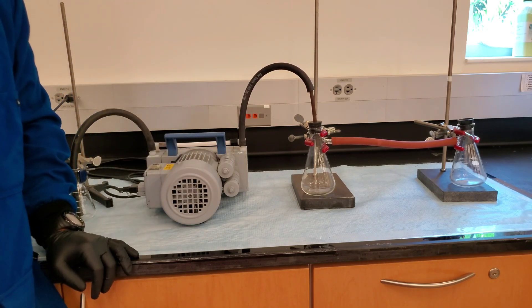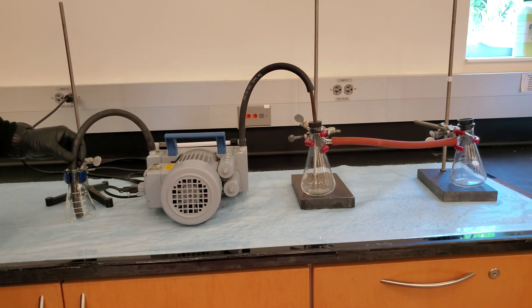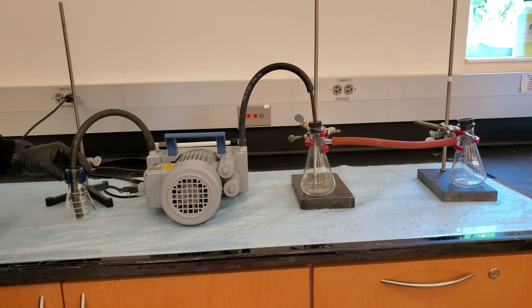Connect the vacuum hose to the vacuum pump outlet and ensure it is facing towards the back of the fume hood, or into a secondary container if not inside a fume hood. This is to trap any chemicals or vapors that are potentially inside the vacuum pump.